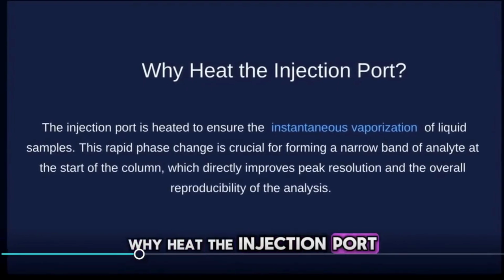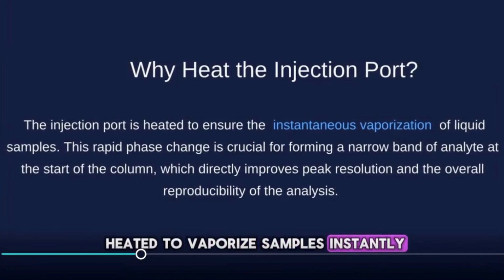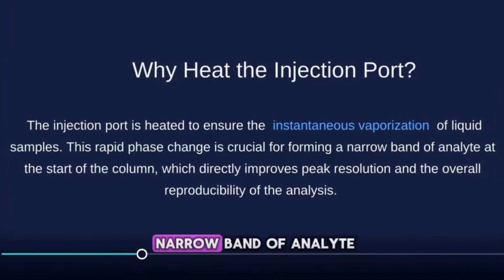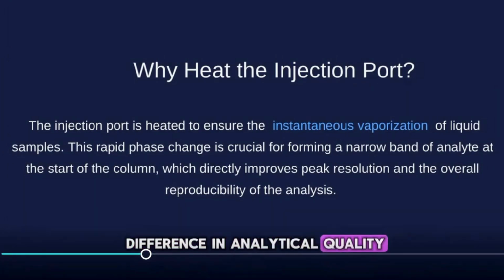Why heat the injection port? The injection port is heated to vaporize samples instantly. This creates a sharp, narrow band of analyte entering the column. The result? Better resolution and consistent reproducibility. It's a small detail that makes a big difference in analytical quality.